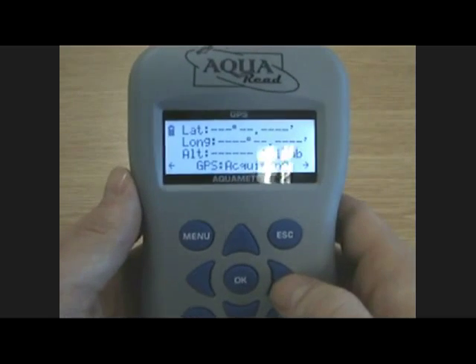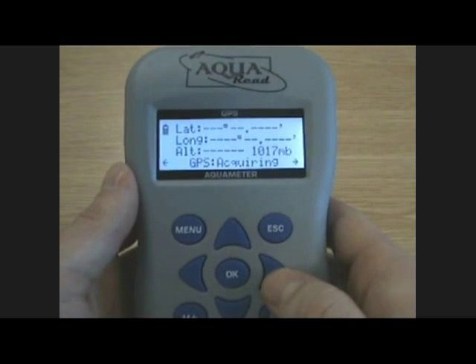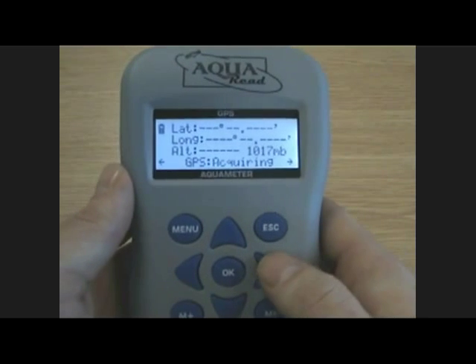One more scroll across brings you to the GPS section. This will display the latitude, longitude and altitude of the GPS meter, along with the air pressure which is measured within the meter.